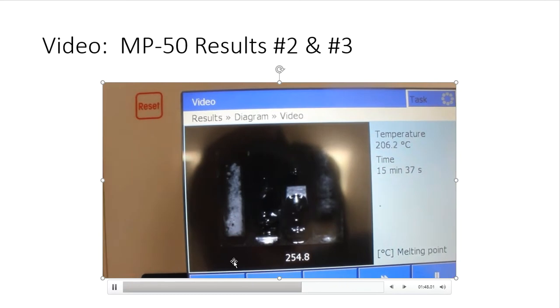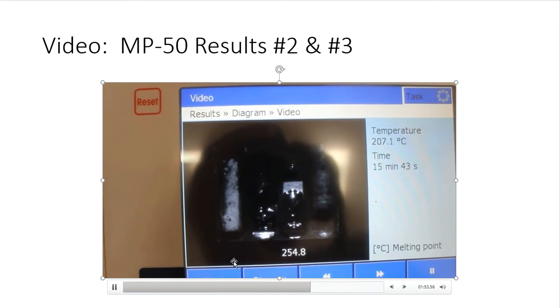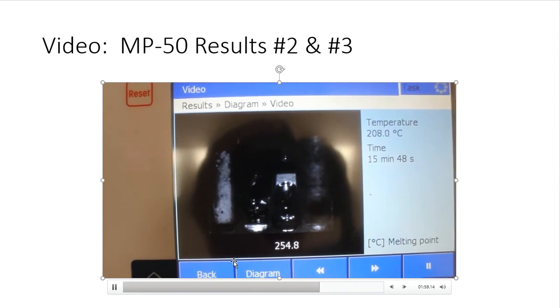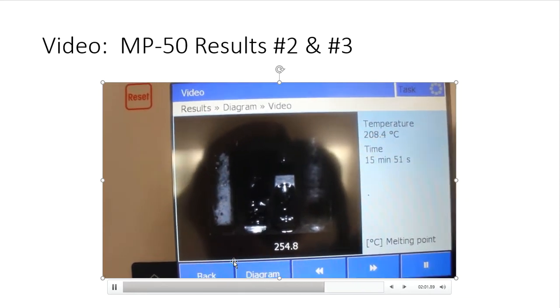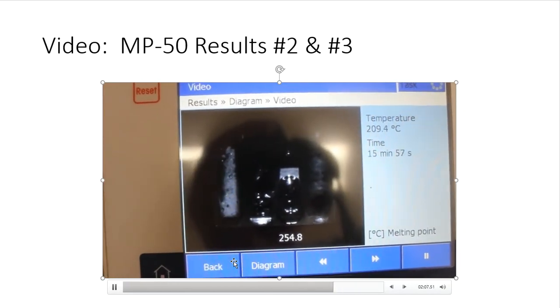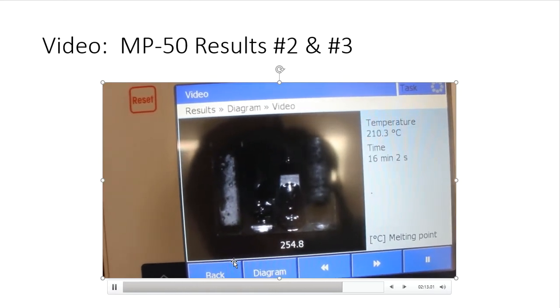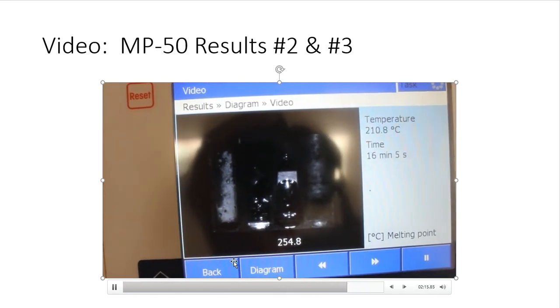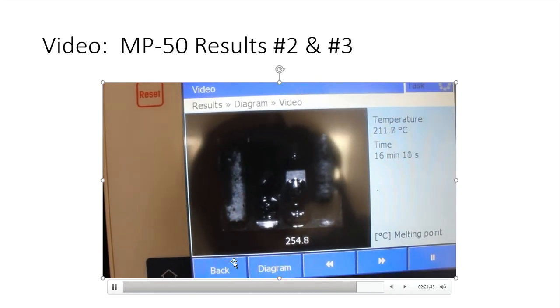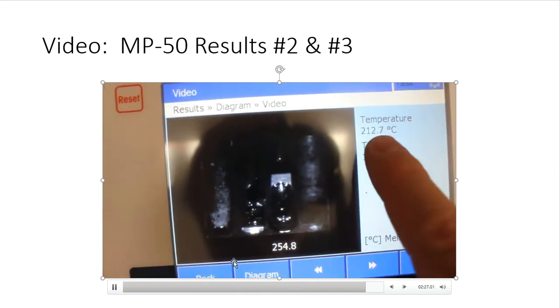So the purpose of this melting point is to compare that to expected O/M/P director products to figure out which melting point it closely matches. And then maybe theoretically explain why we ended up getting the product that we got. So for instance, if this melting point ends up being an O director, why was it an O director? Can we chemically explain why the nitrating group that we added onto the benzene ring went to the O position, or maybe the P position, or maybe the M position? That is the purpose and objective of this lab. And we do that by comparing the melting points with each other.